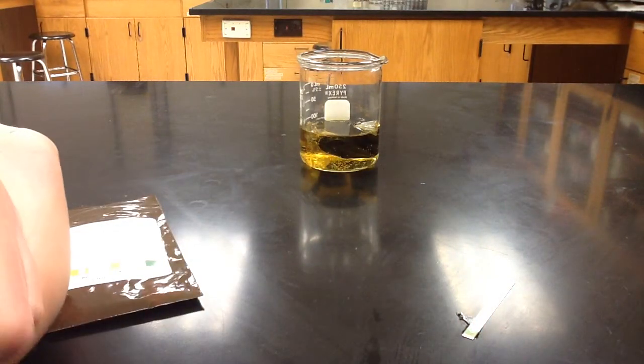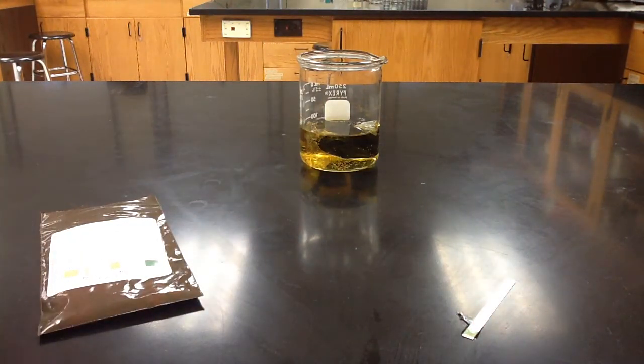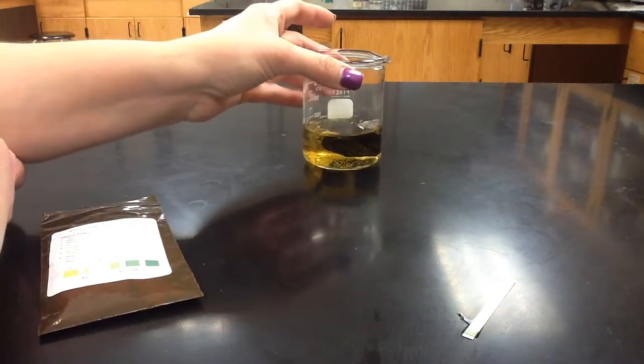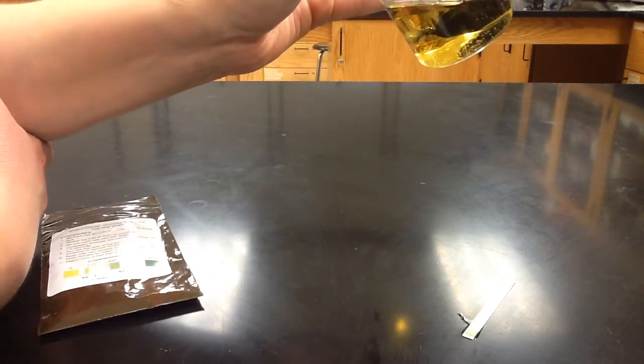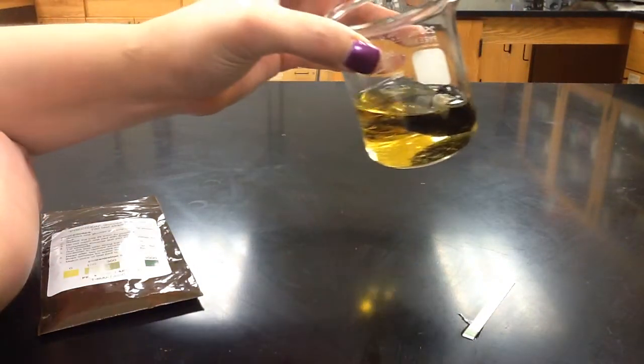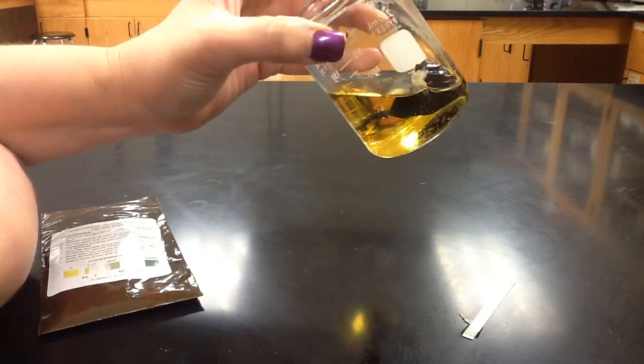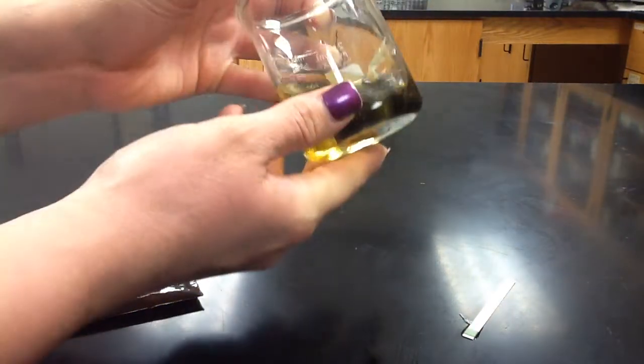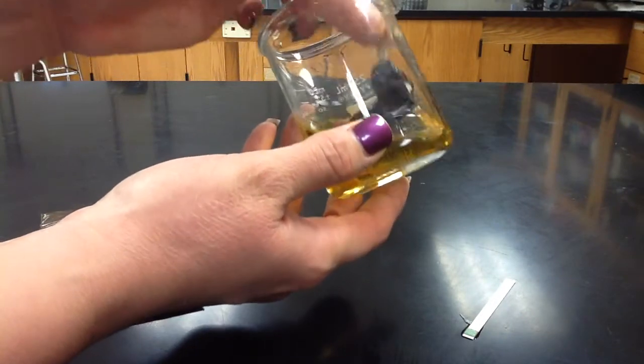And then the last thing we're going to look at is the beaker solution itself and the tube solution. And you can see the beaker has remained that yellowy color, and the tube inside is a dark blue.